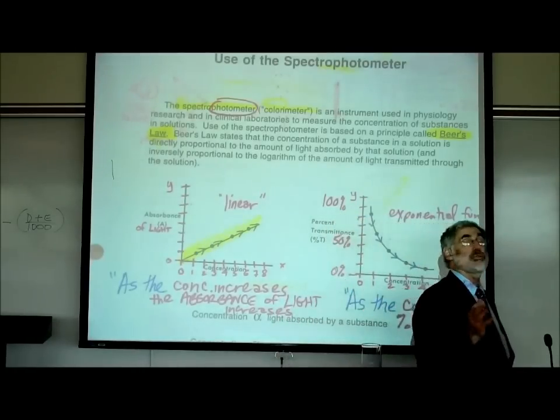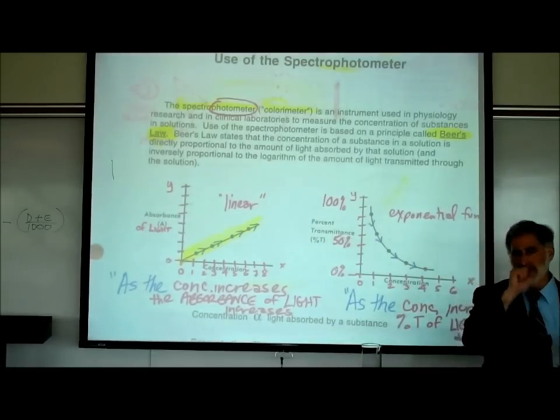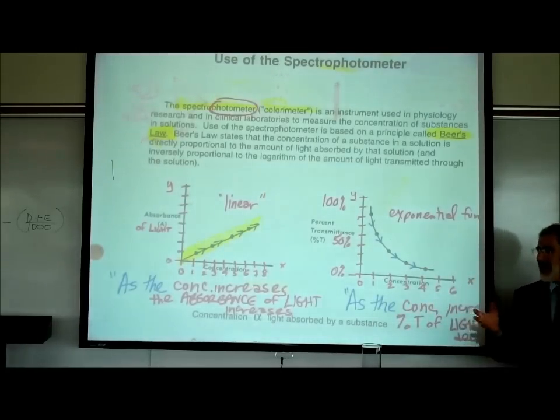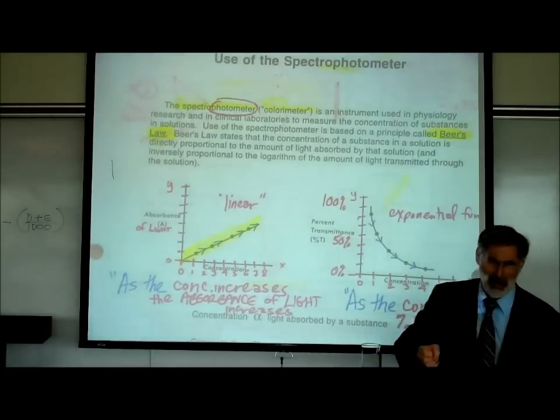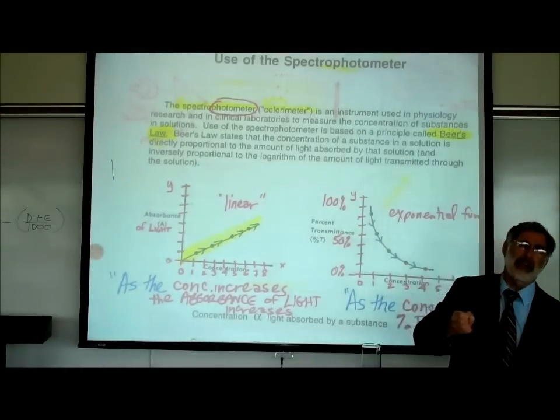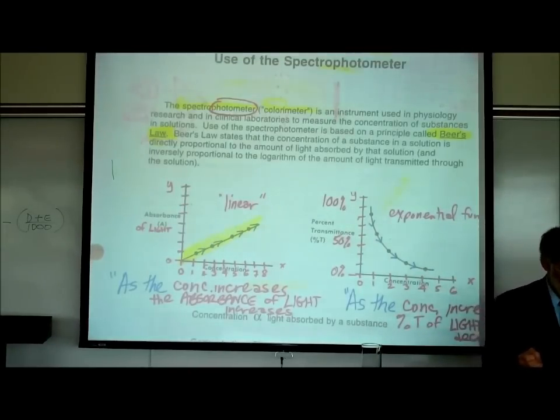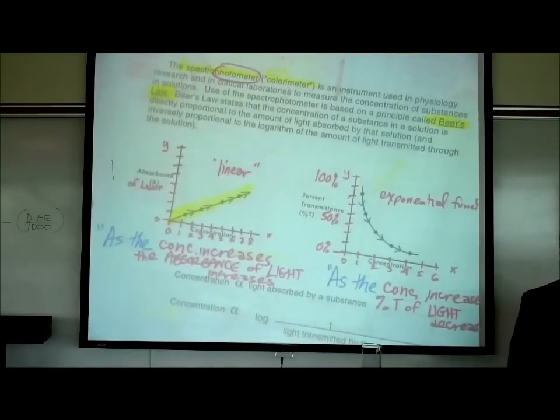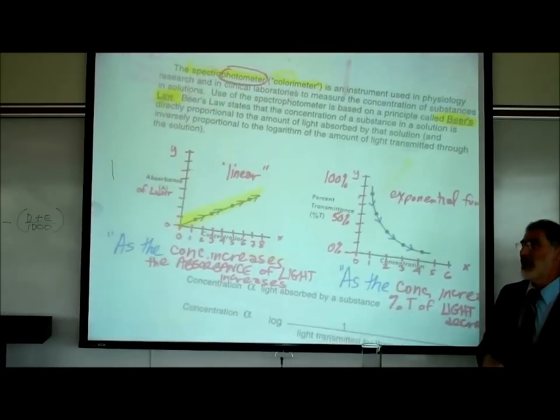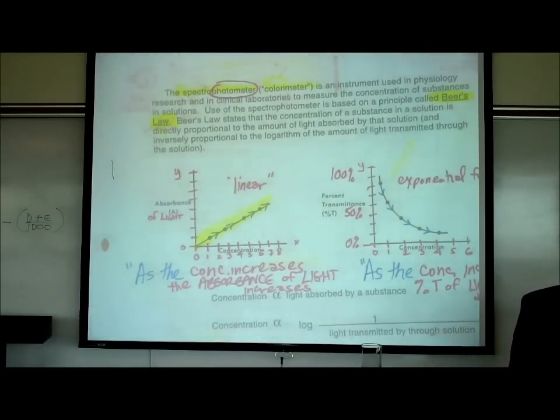It should be below 200 milligrams %. So we've been learning a number of normal values, and obviously when you run blood tests, they measure the cholesterol level and the glucose level and the sodium and the potassium levels in your blood to see if they fall within normal range. The question is, how do they figure that out? How do they determine what the sugar level, what the potassium level, what the cholesterol level is in your bloodstream?